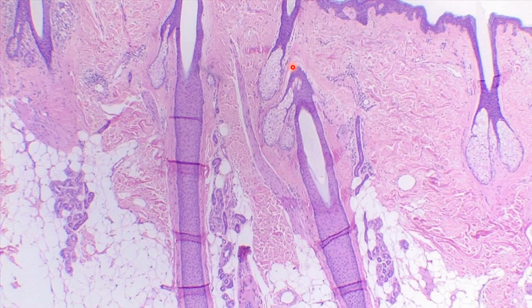You have the epidermis, dermis, papillary layer, reticular layer. As you can see, the purple goes down right into these little ridges, and those are the epidermal ridges. And the part of the papillary layer that goes up, those are called dermal papillae. So let's go ahead and take a look at the next slide.